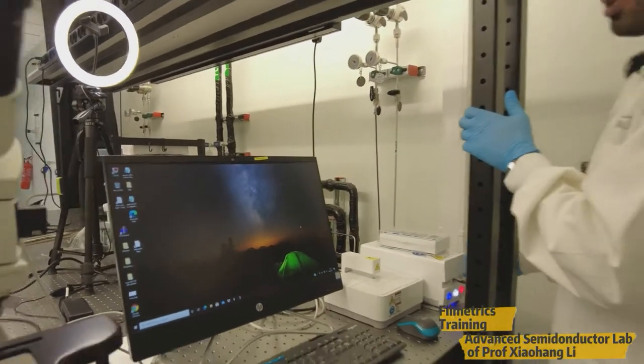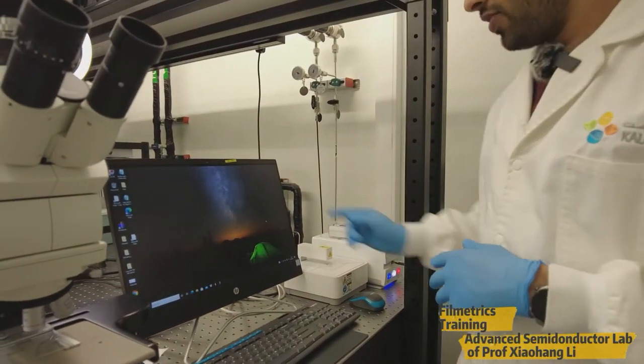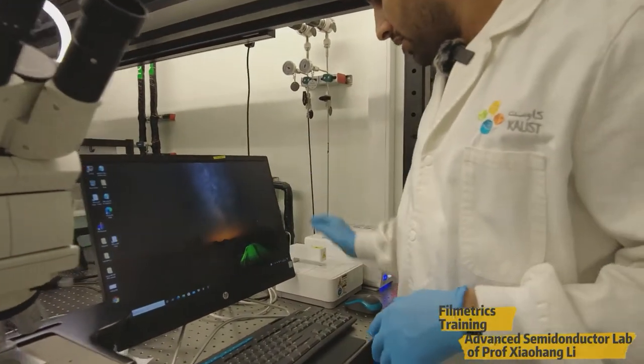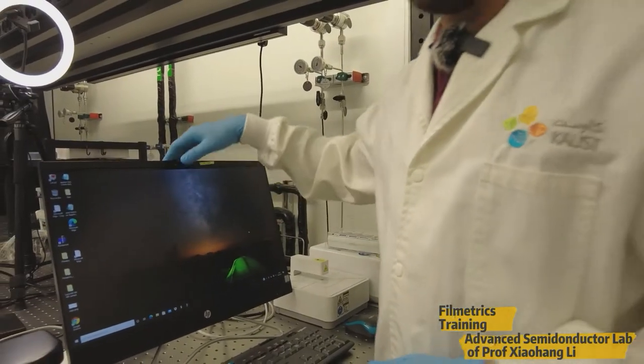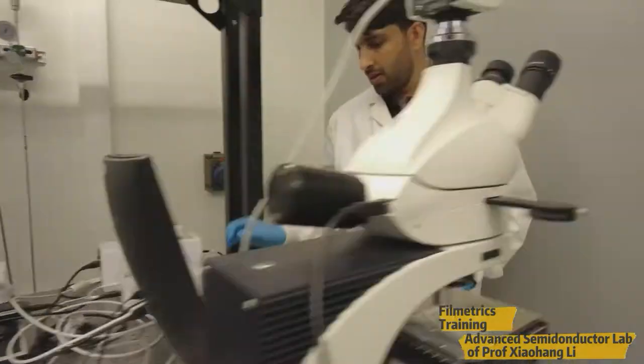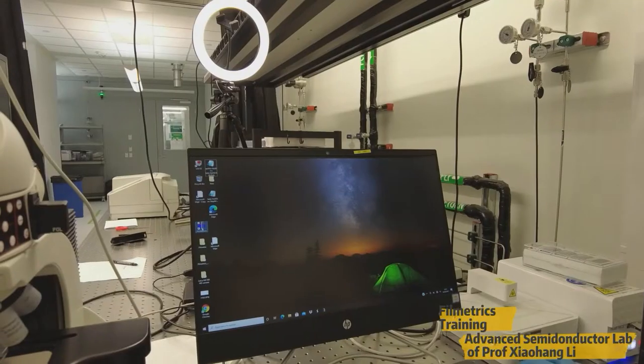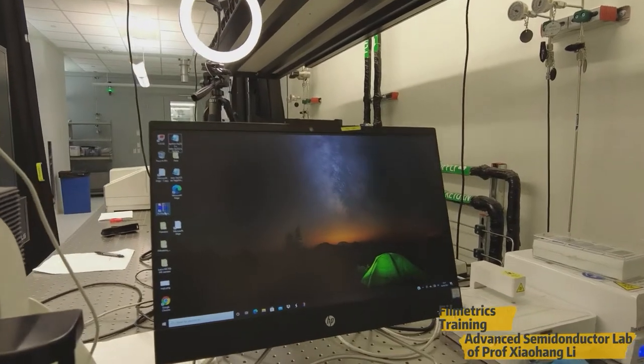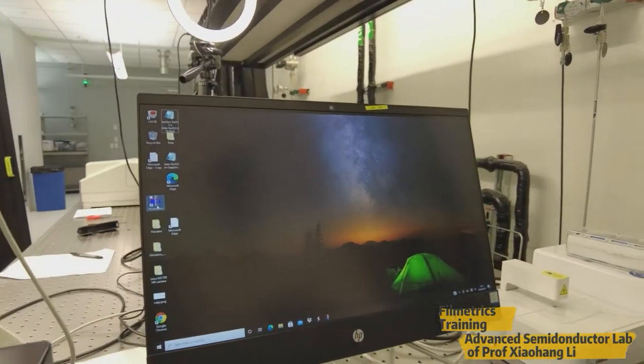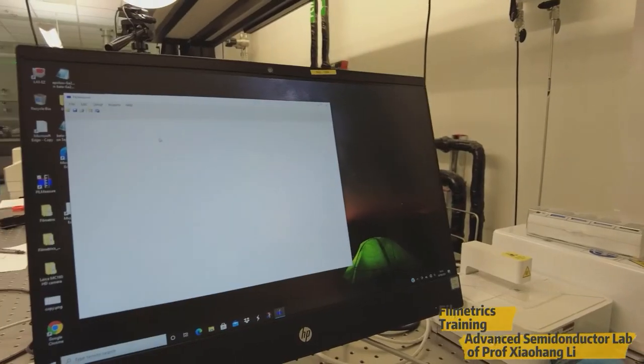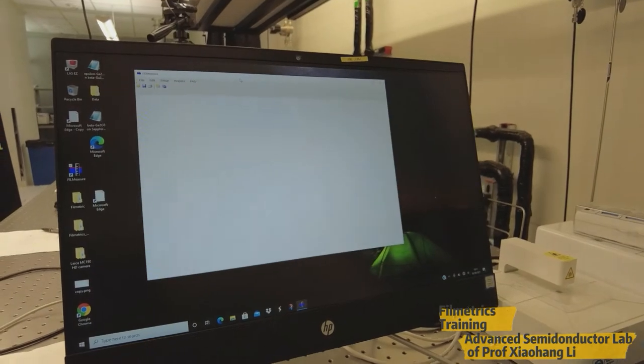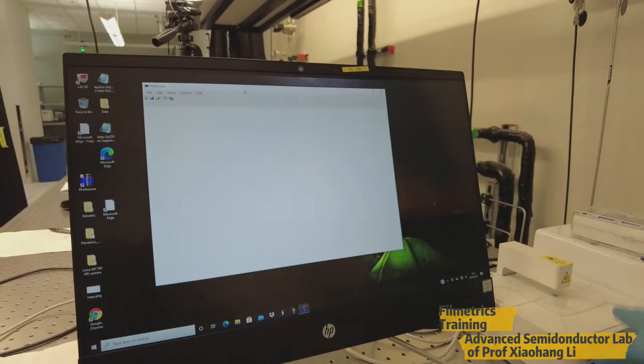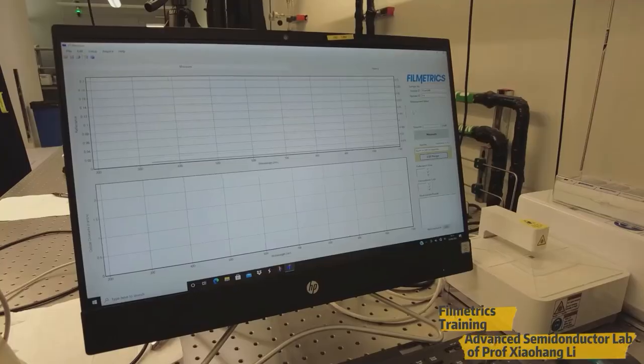So after turning on the lamp, we have to connect the detector connection to the computer. So this is the USB connection for that. This is the window for the controller for this film metric system. So just double click this one. It will pop up this window. So here we can control and operate this film metric.